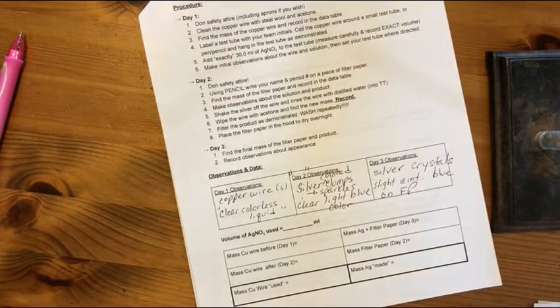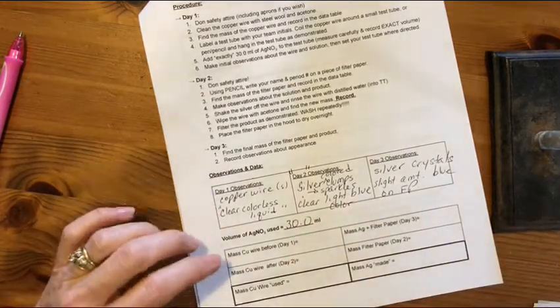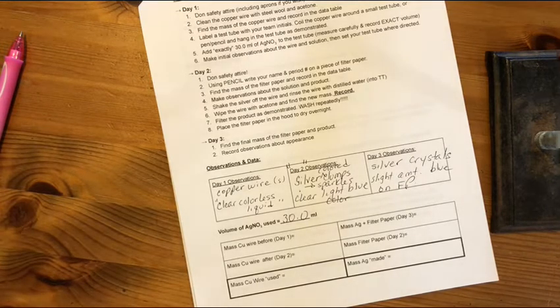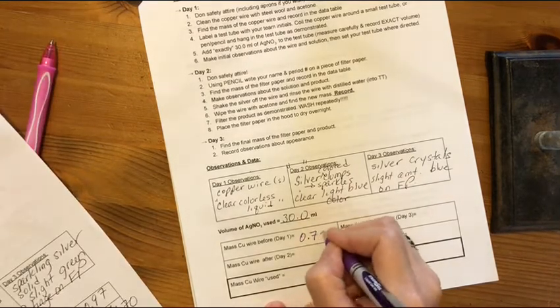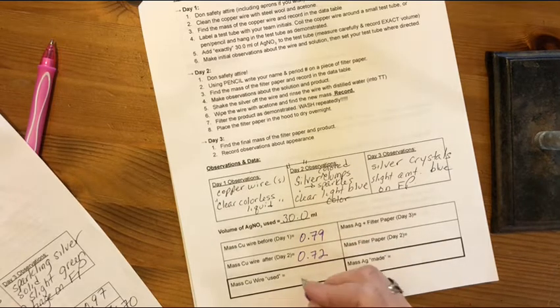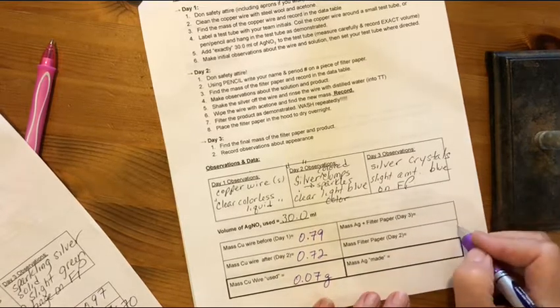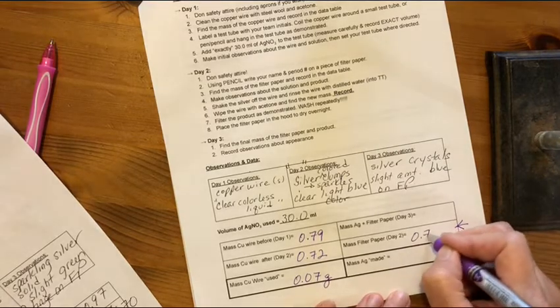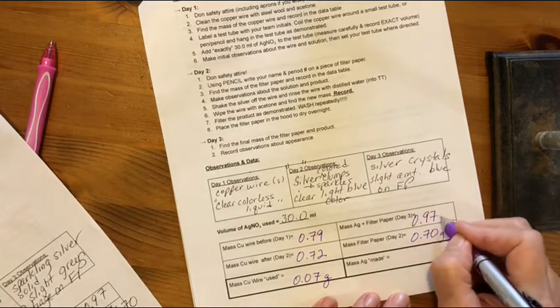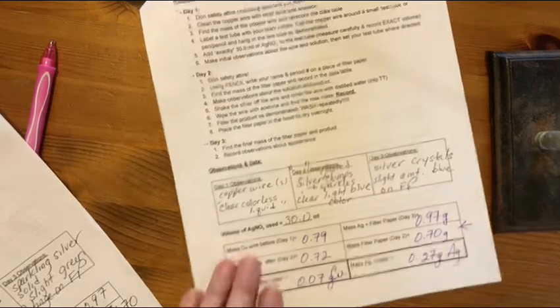Okay, so the volume we used, I got really lucky. It was exactly 30 milliliters of the silver nitrate. And the data from before, as you know, the mass of the wire after was 0.79. The mass, excuse me, that was before, the first day, and then it was 0.72. So the difference between those is how much copper was quote unquote lost or used. It was 0.07 grams. Filter paper, I forgot to mention on the video, the filter paper by itself weighs 0.70 grams. Today, as you saw, we got 0.97 grams. That means there's 0.27 grams of silver on that filter paper.